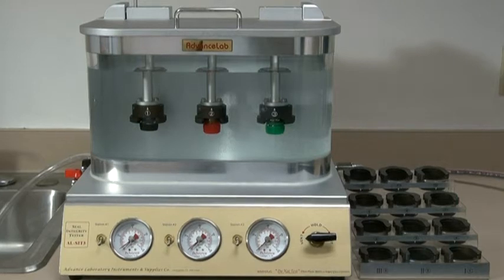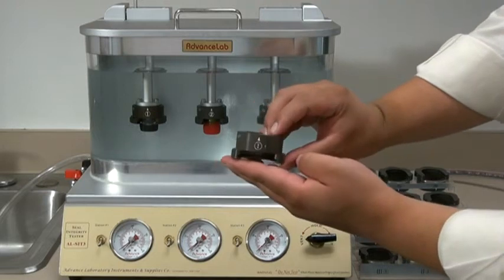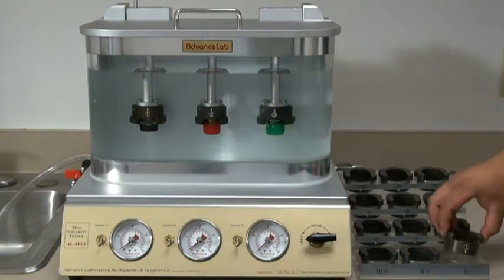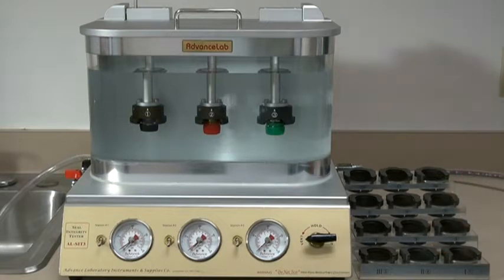Individual cap fixtures are numerically coded for easy tracking of test samples. The design permits the operator to cut the bottlenecks on the production line, eliminating the need to carry multiple full bottles — weighing about five times as much — to the Quality Assurance Lab.